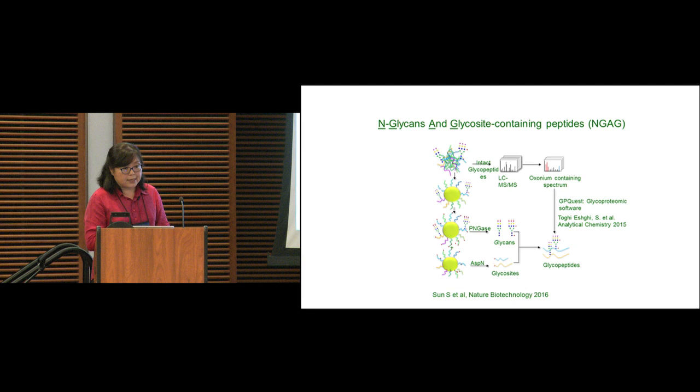This is the approach we have used since we established the N-linked glycoproteomics approach. As you can see, this is still a chemical enzymatic approach. Initially, the peptide is conjugated to the solid phase using a chemical approach. Then after modification, an enzymatic approach releases the glycan, and a second enzymatic approach releases the N-linked glycosylation site.